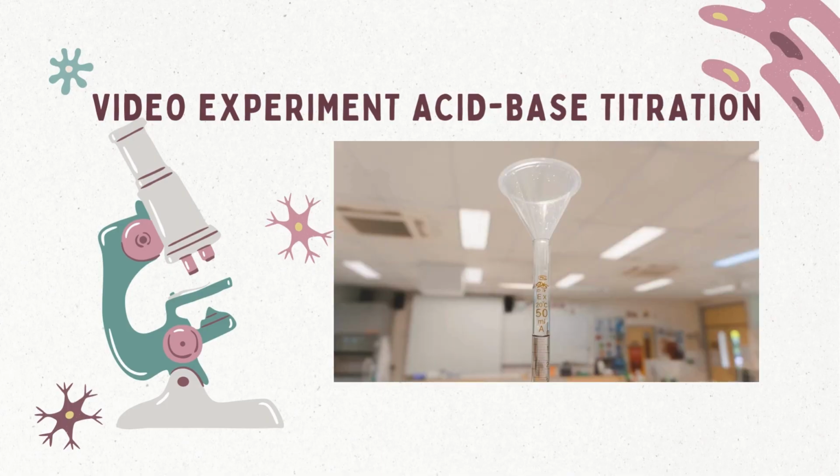Be sure to remove the filter funnel before titration. The presence of the filter funnel on the burette may cause inaccurate readings. A drop or two could trickle from the funnel into the burette. In titration, a drop or two could mean the difference between a successful and a failed titration. You should be ready to begin titrating now.